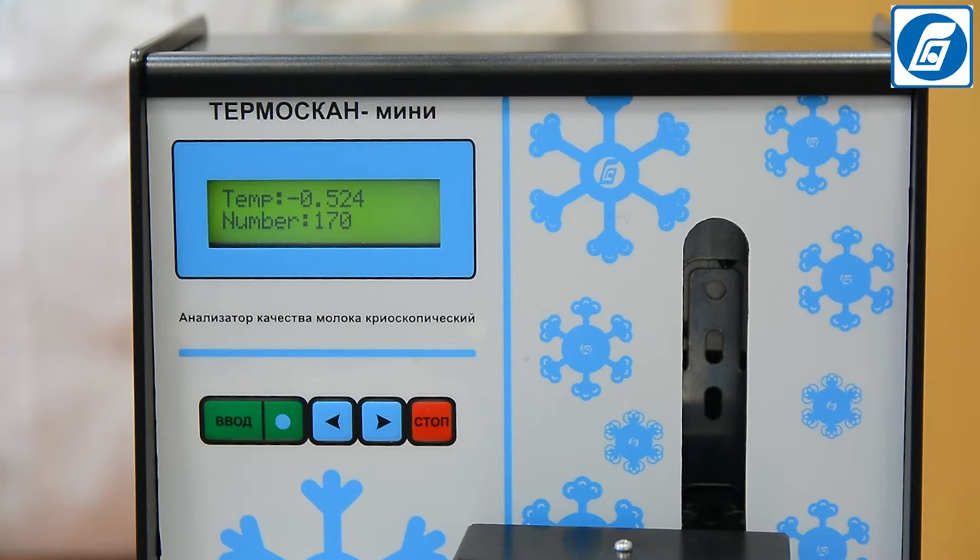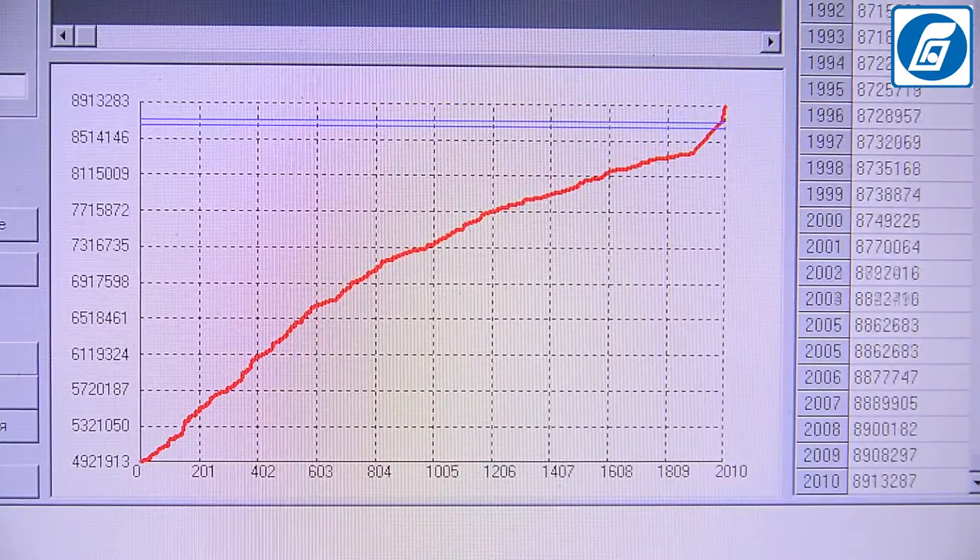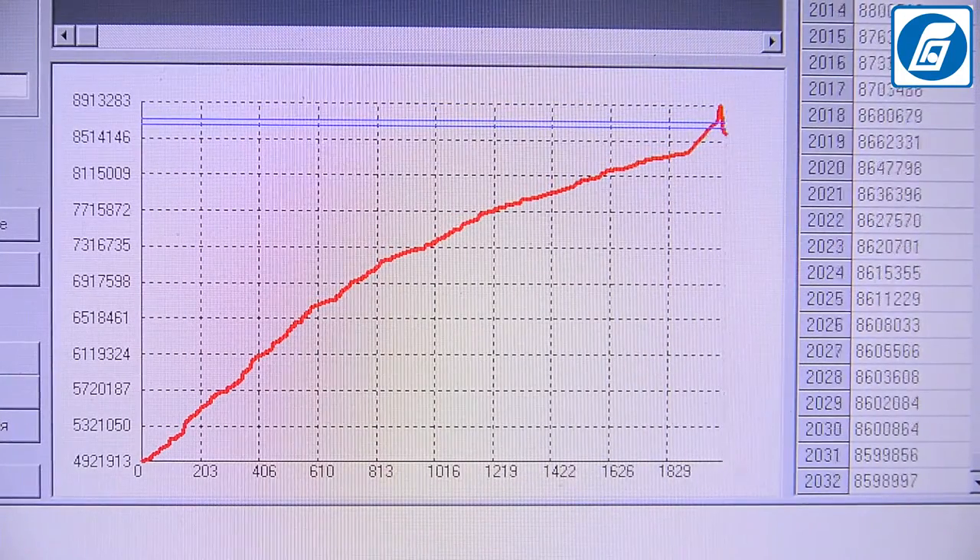Thermoscan Mini cryoscope has the option for saving measurement data in the analyzer's memory, transferring them to a PC, processing in a special program, and printing out measurement results on a special printer.